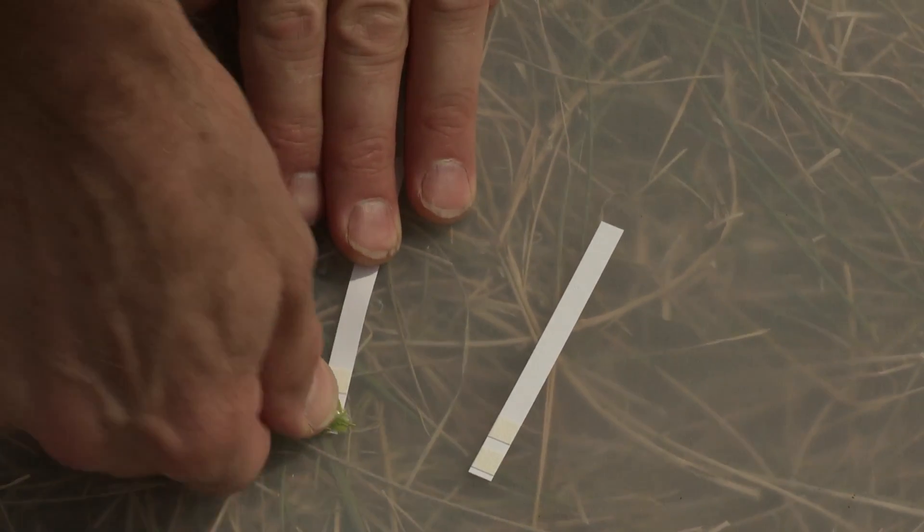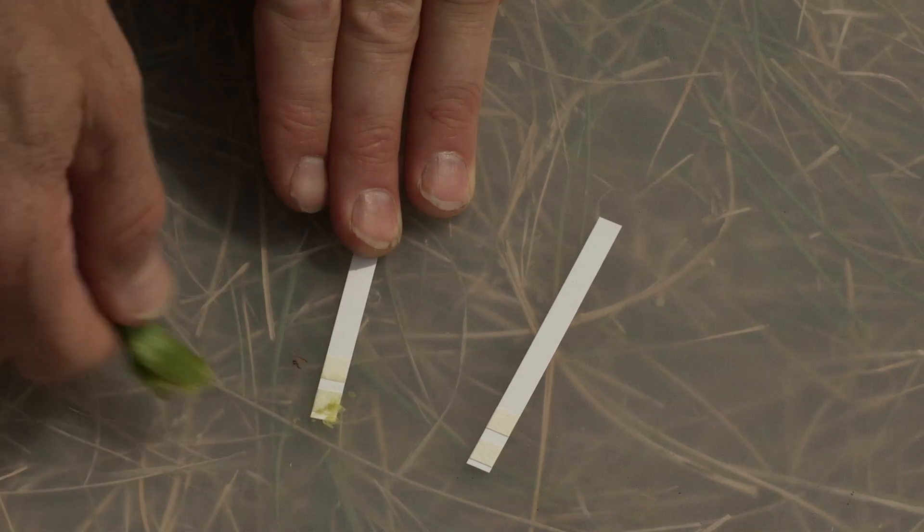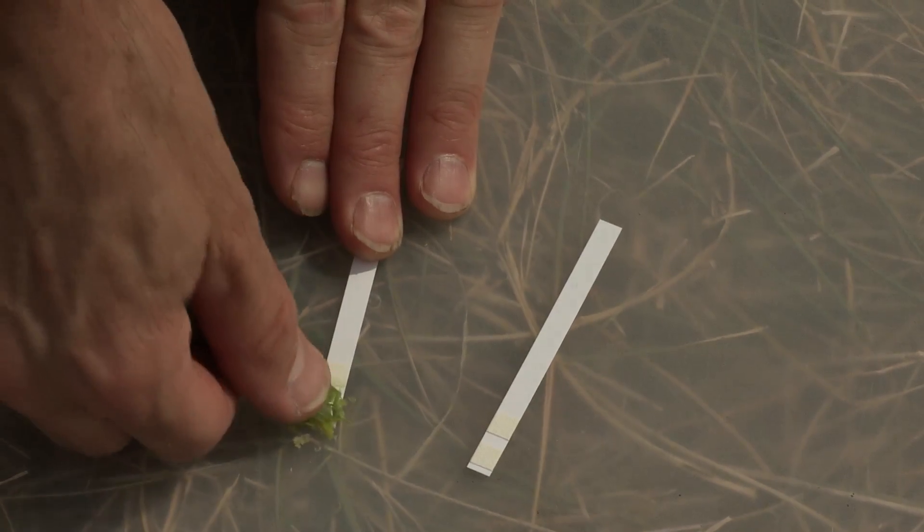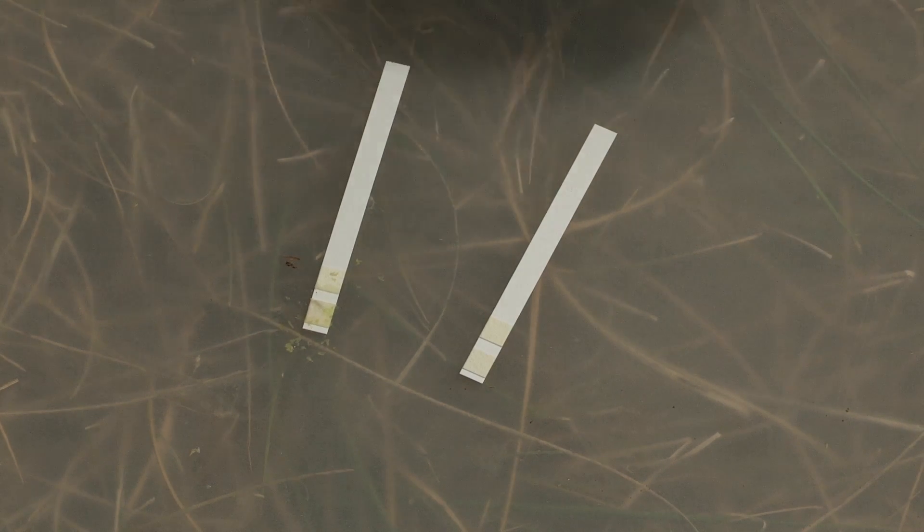You can take a stem of, for example, sorghum sudan grass in this case, and just simply squeeze a little bit of juice out on the end of the test strip and look to see if there's any color change. The recommendation is after the juice is squeezed on there to wait for one minute.